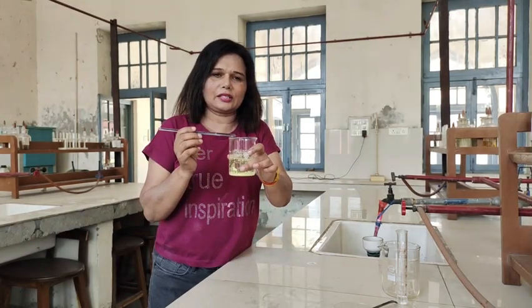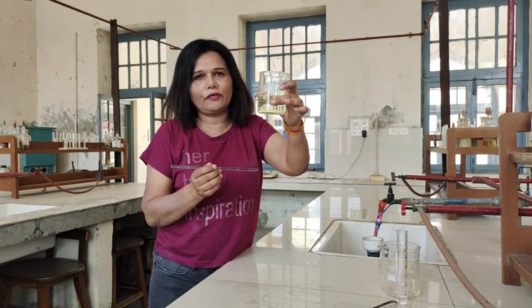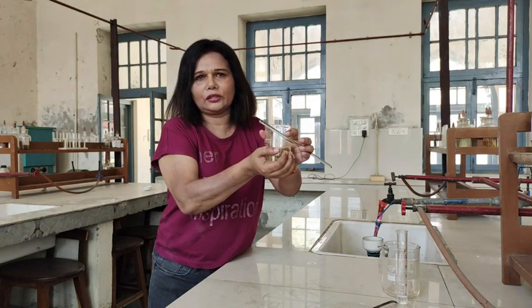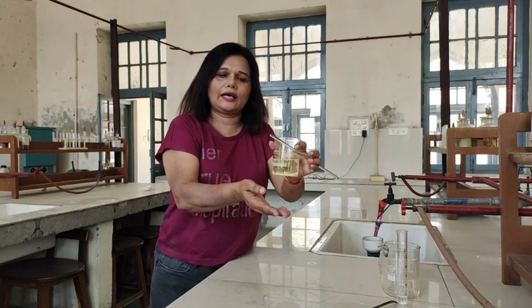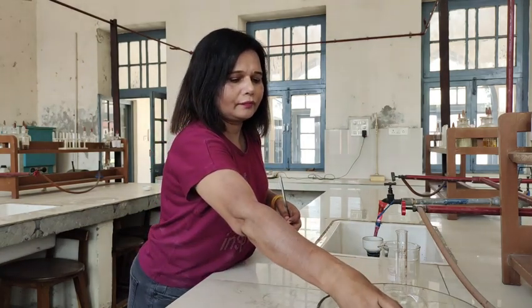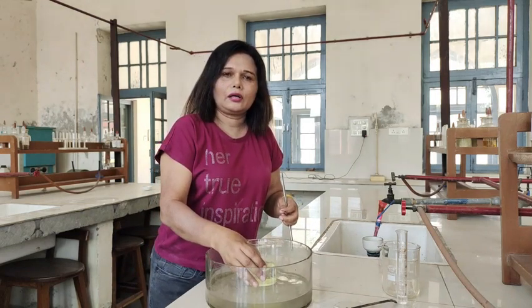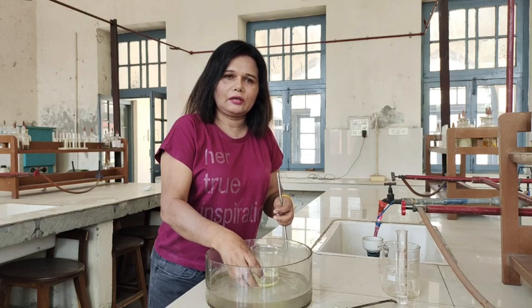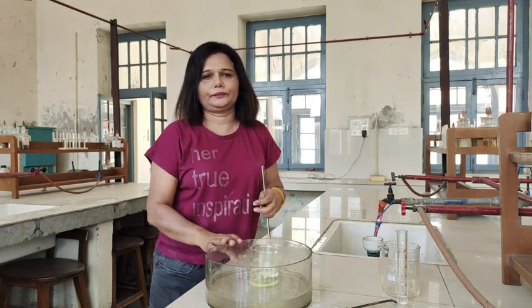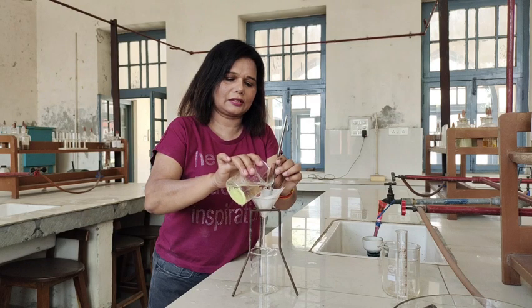So students, you can see we get the crystals of iodoform, lemon yellow crystals of iodoform. As we feel it, it is very hot because the reaction is exothermic. So we'll cool it in an ice trough. Here it is. We'll keep it for some time. After that, we'll do the normal filtration using a funnel and filter paper. Now we'll do the normal filtration to get the crystals of iodoform.